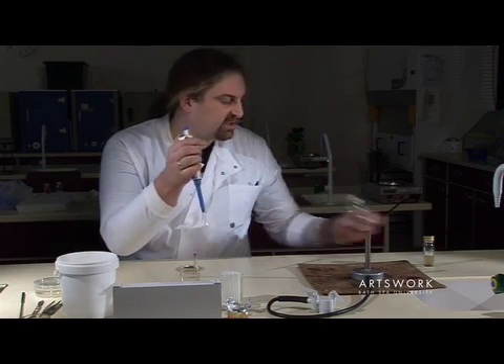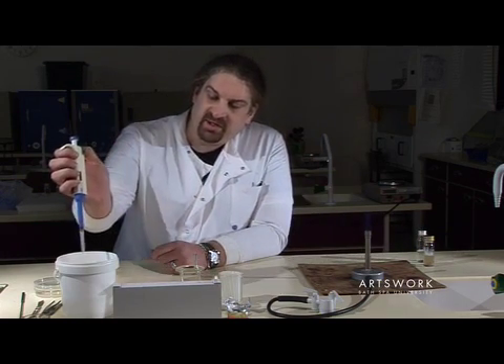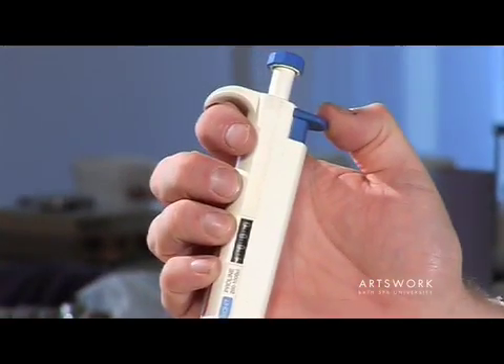Sterilise your sample pot, and then to dispose of the pipette tip, hold it over the pot of disinfectant and press the pipette tip ejector.